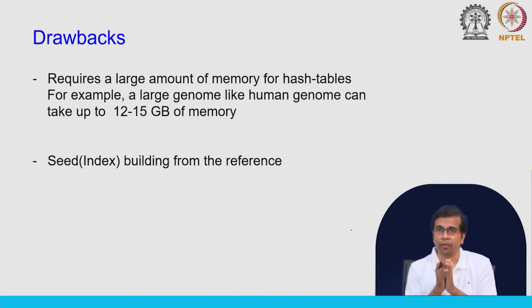So, again the question is, can we not keep the seed length the same, can we not say, let us say, set k equals 10 or k equals 5? Now, this actually is a problem. We cannot keep this fixed, because we may be working with different data from different platforms, and they come with different read lengths, and also different sequencing errors.